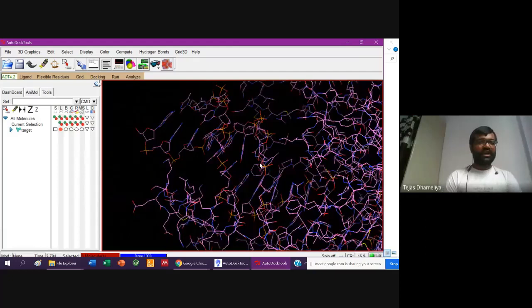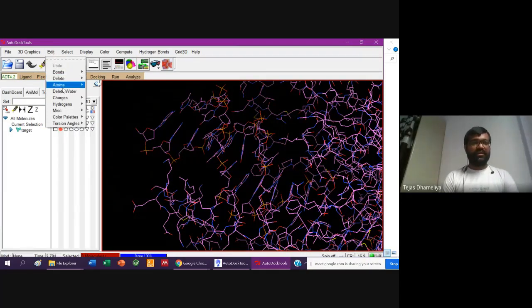So how should we plan next? This is our protein already. We will go to edit and delete the water. We will delete the water first.